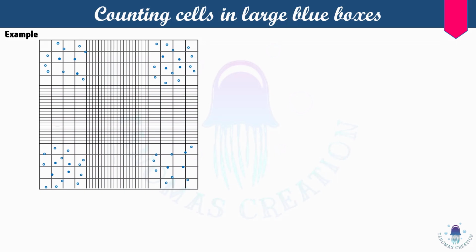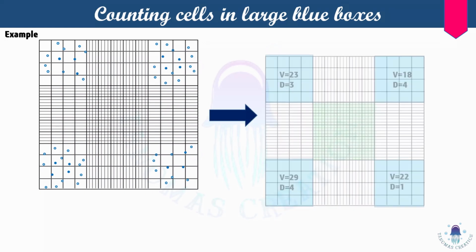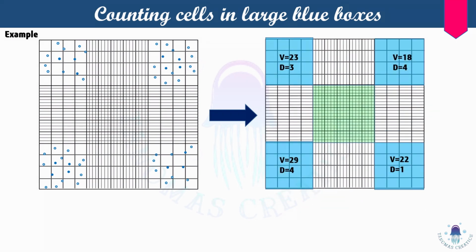Okay, so we need to count it. Let's say there is this much amount of viable and dead cells present in the four corners, that is, these large blue boxes. So this much amount of viable and dead cells are present.